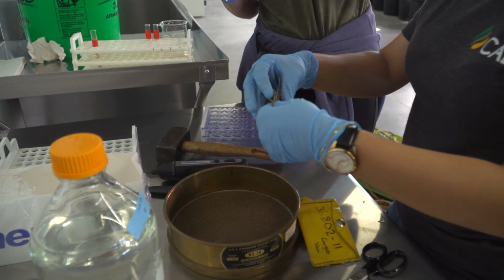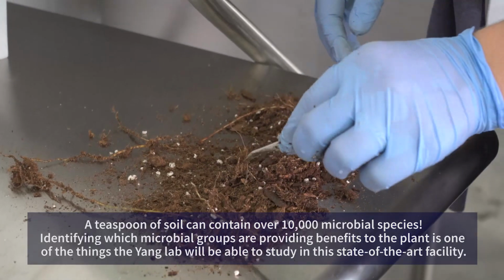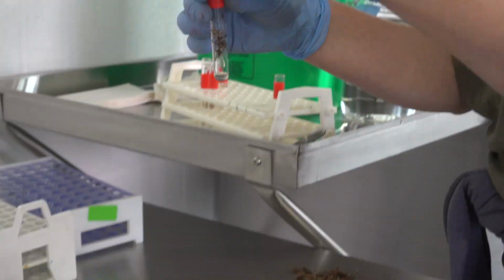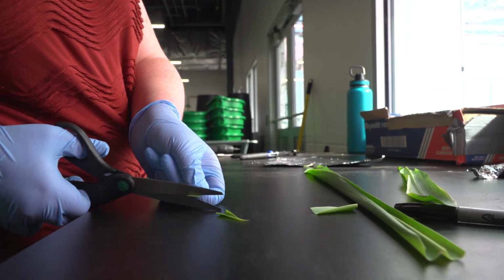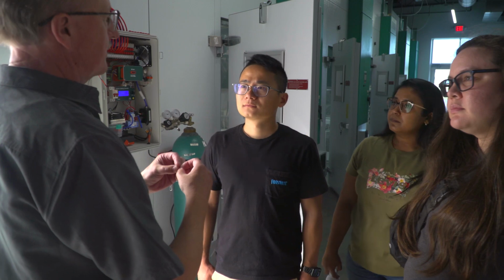Interactions between plants and microbes can be really important. A teaspoon of soil can contain over 10,000 different microbial species, and most of the microbes in the soil at any given moment are not active. This means that it's really difficult for us to determine which microbes are contributing to the important plant-microbe interactions. I'm really excited about this facility because using stable isotope tracers allows us to look specifically at these plant-microbe interactions. And that will allow us to answer questions that we haven't been able to address before.